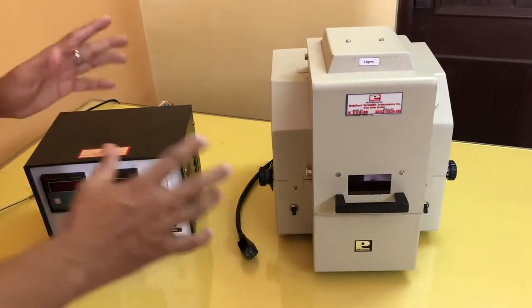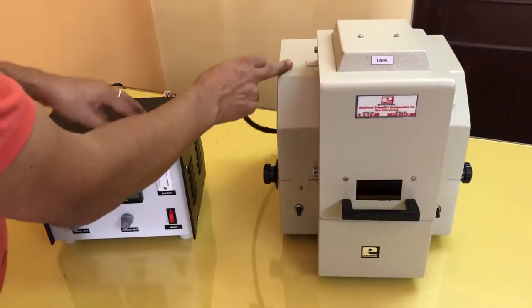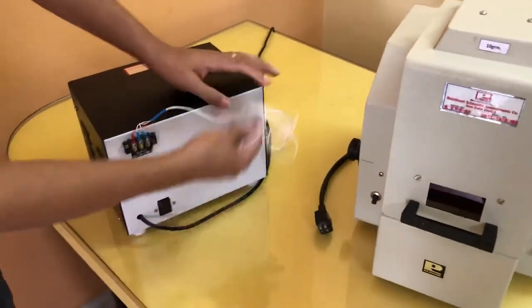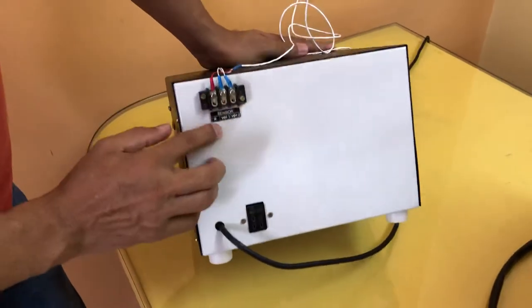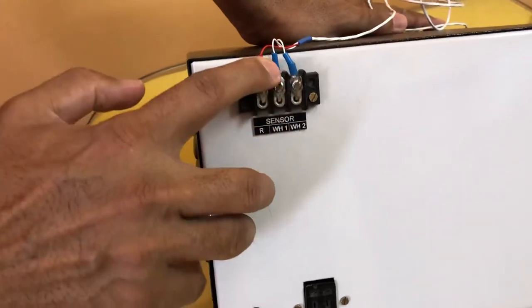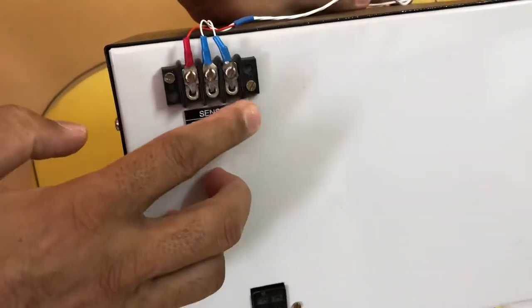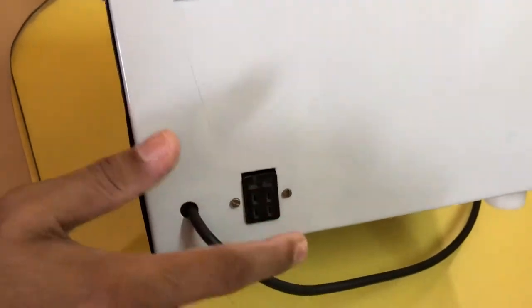First I will cover the installation part. This is the main unit, this is the control unit. To connect the main unit with the control unit, a six-pin connector is given. On the back side of this control unit, this port is there for the sensor. Where it is specifically written: R stands for red wire, WH1 stands for white wire 1, WH2 stands for white wire 2. These WH1 and WH2 can be interchanged — there won't be any problem. And this is the connector for connecting the main unit.